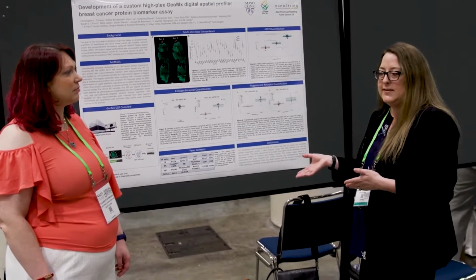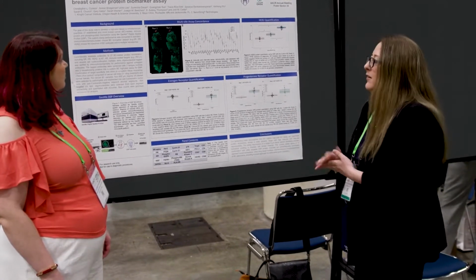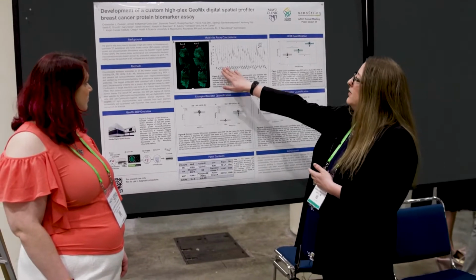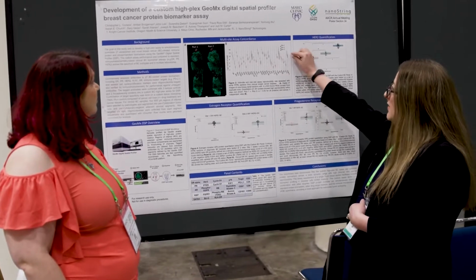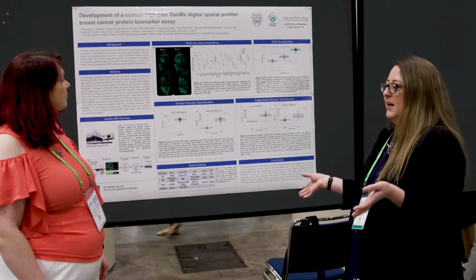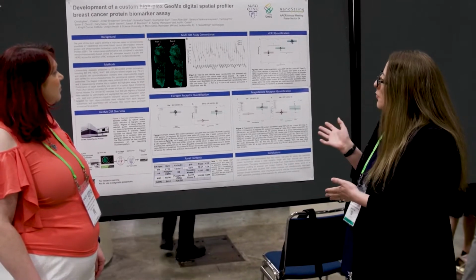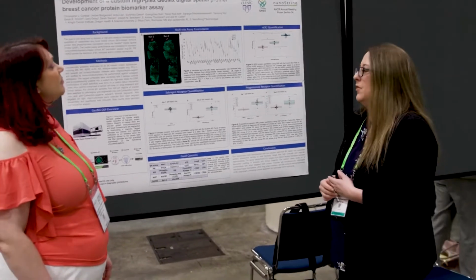relevant proteins together. So to validate this assay, they ran it at 3 different sites, 2 at the Mayo Clinic and then 1 at OHSU. And here is just looking at run-to-run variability for each of the different targets in the panel. You can see that they're very, very close together. So even with different instruments, different users run at different times, the assay was performing very, very well each run.